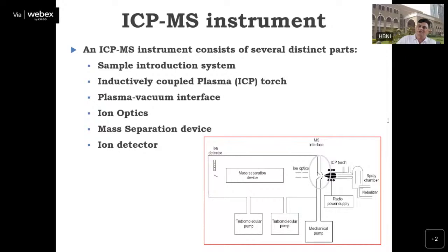That's what we had discussed also, adsorptive stripping voltammetry, where we pre-concentrate on a chloroanilic acid on a mercury drop, and thereafter we can do the determinations. But so far we have not done it by using AAS. I don't remember exactly the line also. If I remember the line, I can tell you whether we can do the analysis by AAS or not.